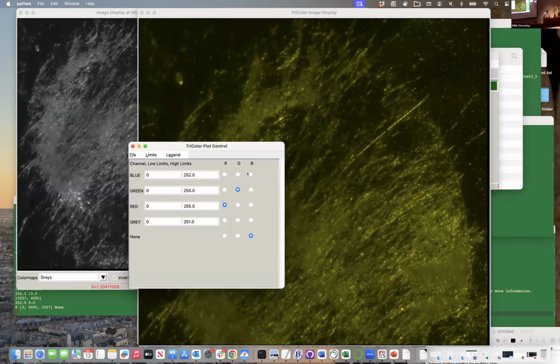Now you may be wondering why the tricolor image is giant and my other image shrunk. It's because I haven't written that part of the code yet. But trust me, I'm aware of that, and that will get fixed in a new version. So yeah, you can see there's a little bit of color to these little corners here, a little goldness to the hyphae there. There's how you can see your images in living color.